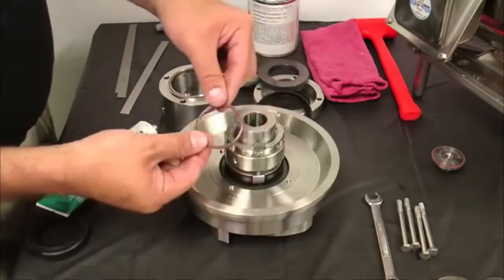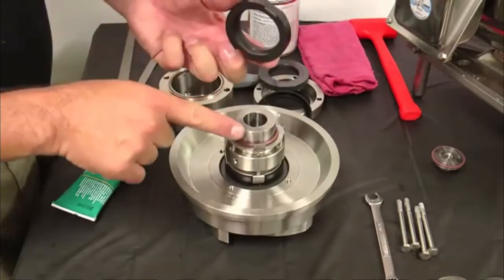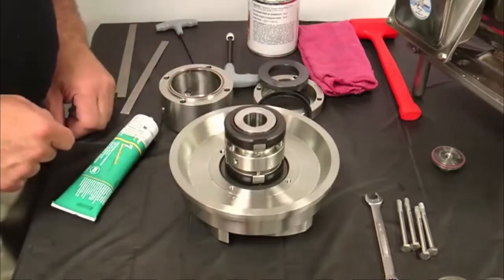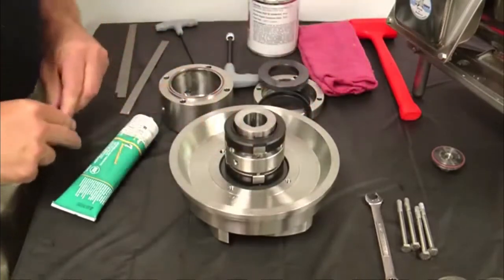Place a second lubricated seal O-ring over the impeller shaft. Gently place the inner seal over the impeller shaft onto the seal seat with the seal face facing up and the washer tabs aligned with the slots on the spring retainer. Push down on the seal until you feel the seal O-ring seat into the seal.